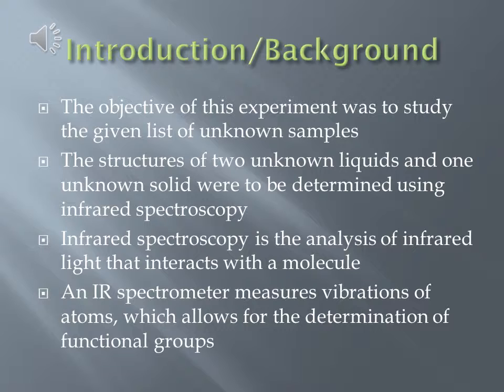The objective of this experiment is to study the given list of unknown samples, and off of this list, the structures of two unknown liquids and one solid will be determined using infrared spectroscopy.